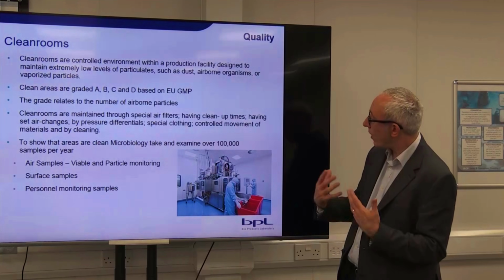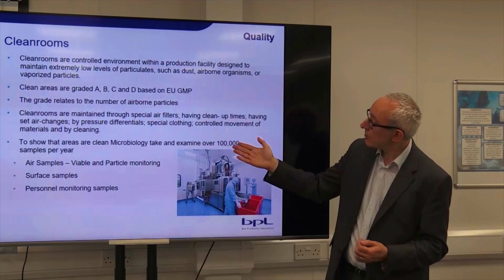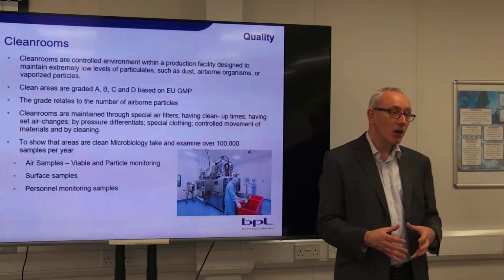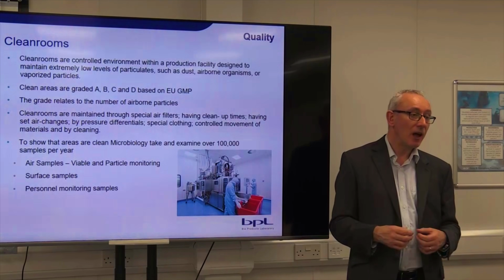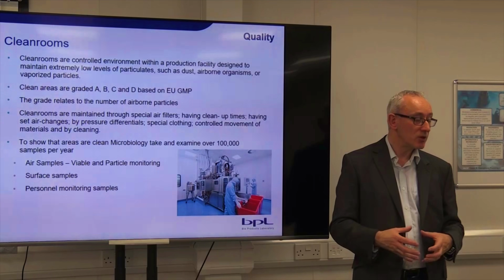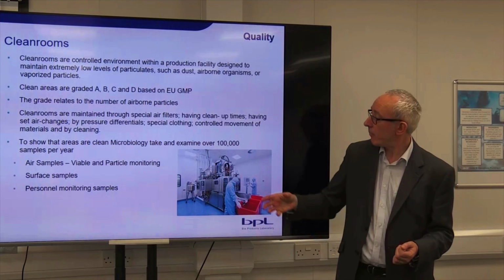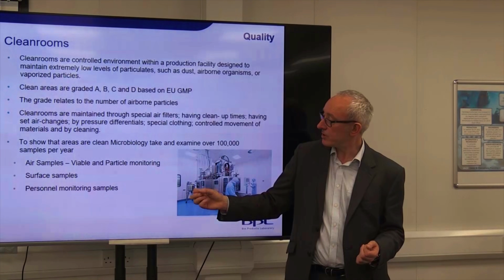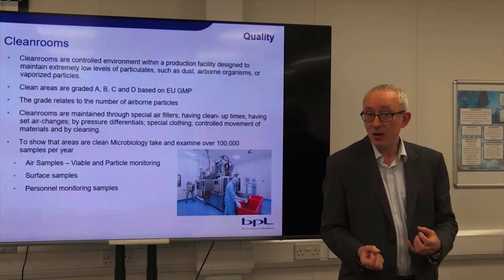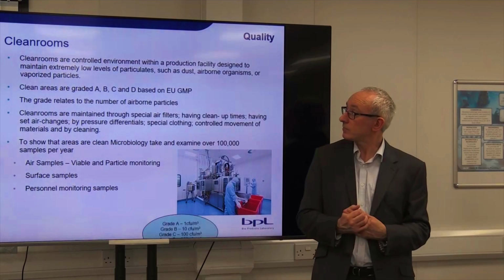And then there's also wearing of appropriate clothing and the actions of cleaning and disinfection. And then to verify this, the microbiology department go out throughout the factory and they're taking different samples using agar, which is the jelly-like substance, which provides a growth medium for bacteria, and by sampling the number of particles in the air, and even if you're working in the aseptic filling area, samples directly from people's suits and from their fingers.